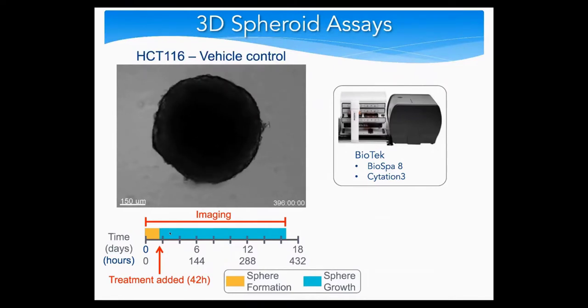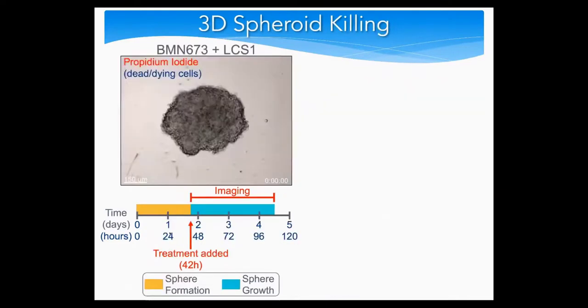And so what this really allows us to do is basically try those various different combinations to see if they impact cellular growth. And this particular 3D spheroid model is obviously much more akin to what you might see in an individual, although it's very much smaller, and it's more representative than the traditional 2D culture systems that are used by many groups.